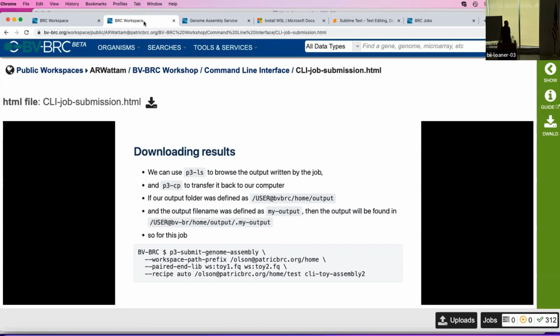And also through scripts, if you had something that's going to take a lot of time, you potentially queue up a script and it runs and does its thing. Yeah. If you've got, again, your 1,000 FASTQ files, your tens of gigabytes of data that you load, you don't want to have to leave your computer on and running and doing those uploads and worrying that they'll crash. You can do the submission right from where the data is.